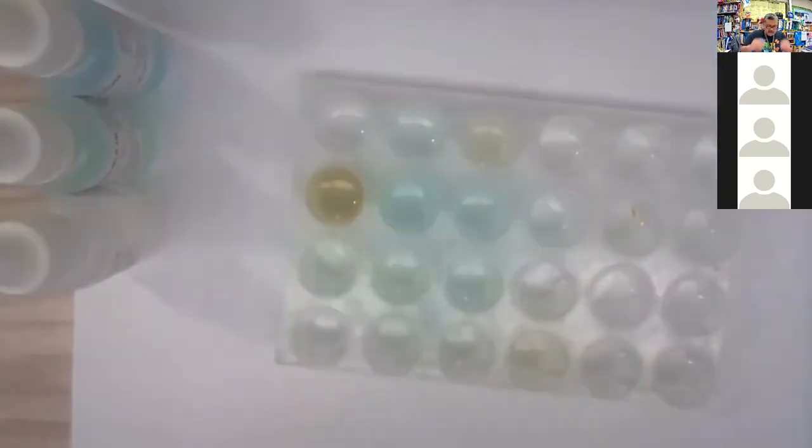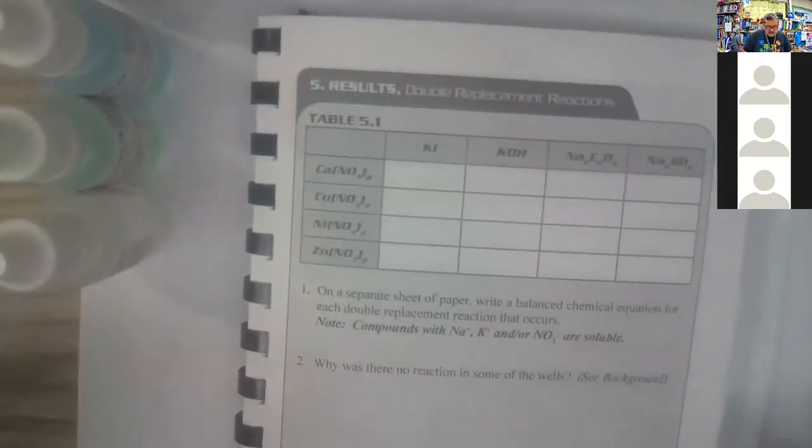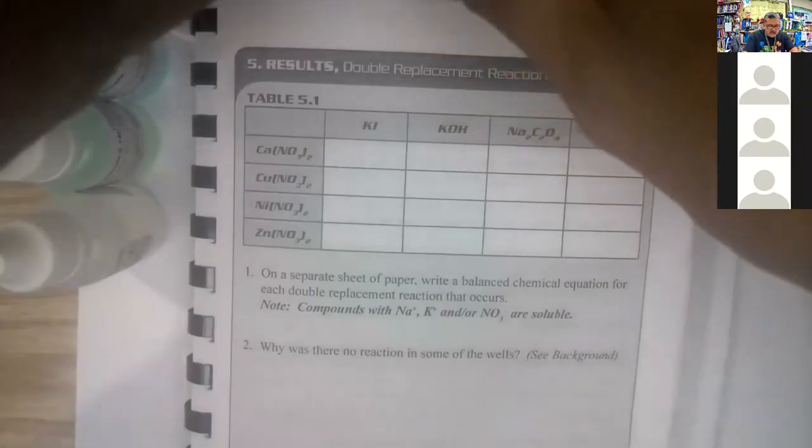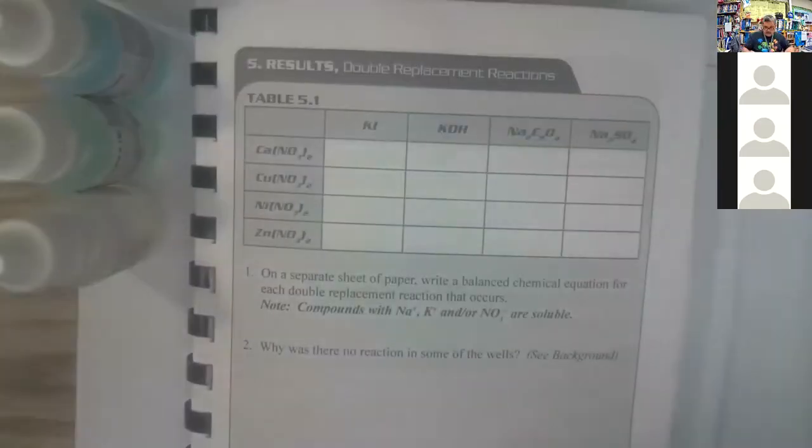Okay, so now you have it. We've gone this way in all 4 rows and this way in all 4 columns with all of the different chemicals. And so you should be able to complete that table now, and you should be able to answer some of the questions. Take a look at Canvas to get the rest of the questions.